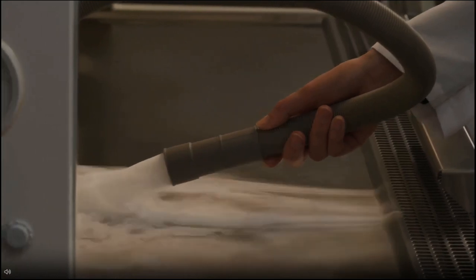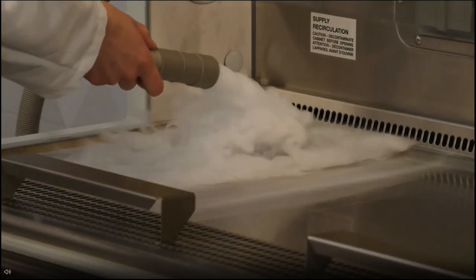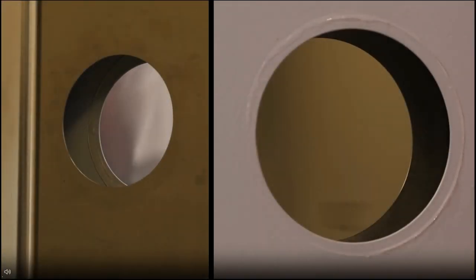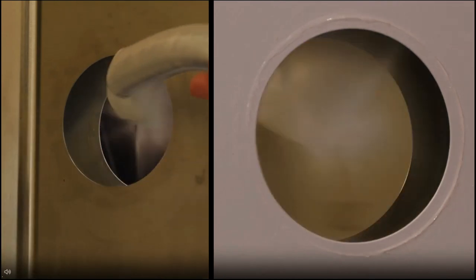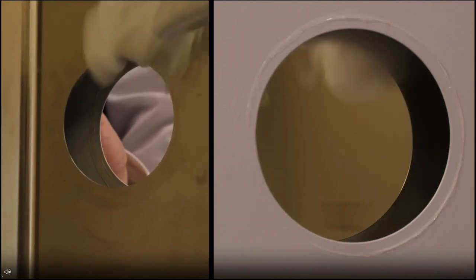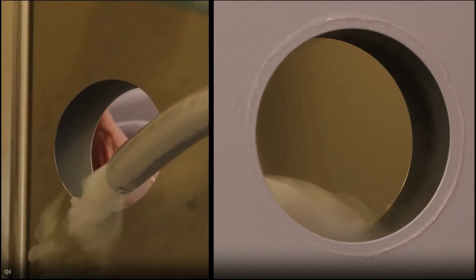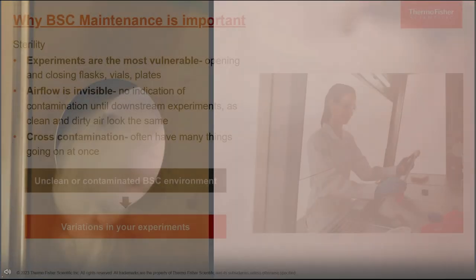When we go to the next image, you can see how a biosafety cabinet works within a localized environment. This is an image of a smart port — when we put the smoke machine to our smart port, we have two walls that are negatively pressurized. Any air inside the biosafety cabinet is not getting to the outside environment or vice versa. You can see that the smoke is being sucked up through the smart port.